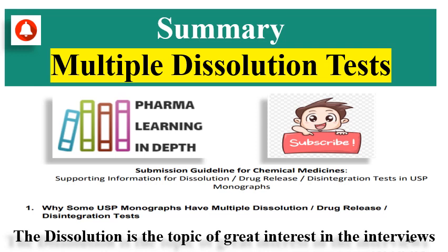And if the formulation is not in the monograph, at that time the applicant has to develop a discriminatory dissolution method and submit it in the application. So this is regarding the multiple dissolution tests.